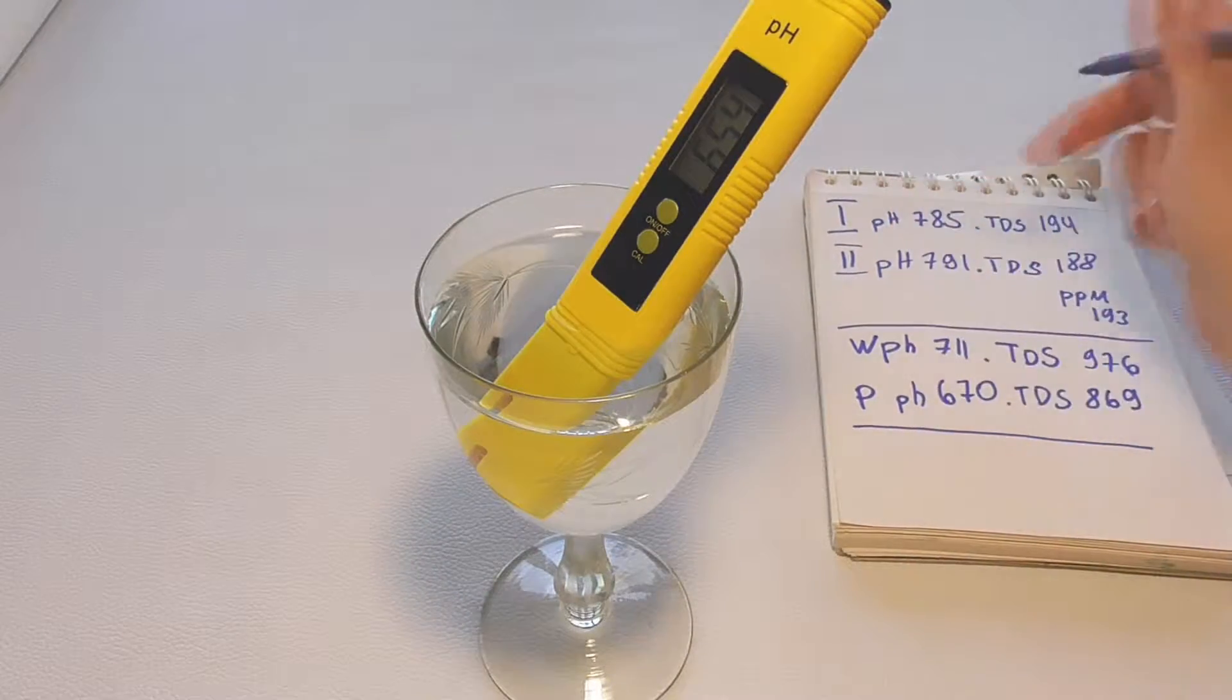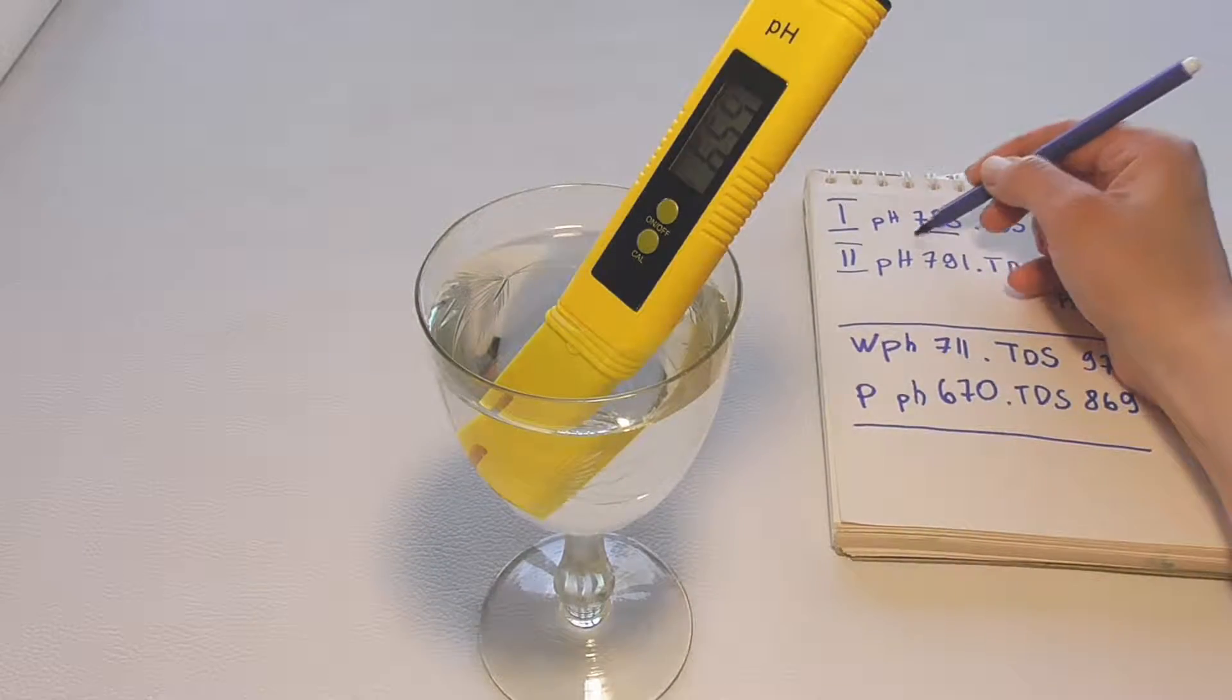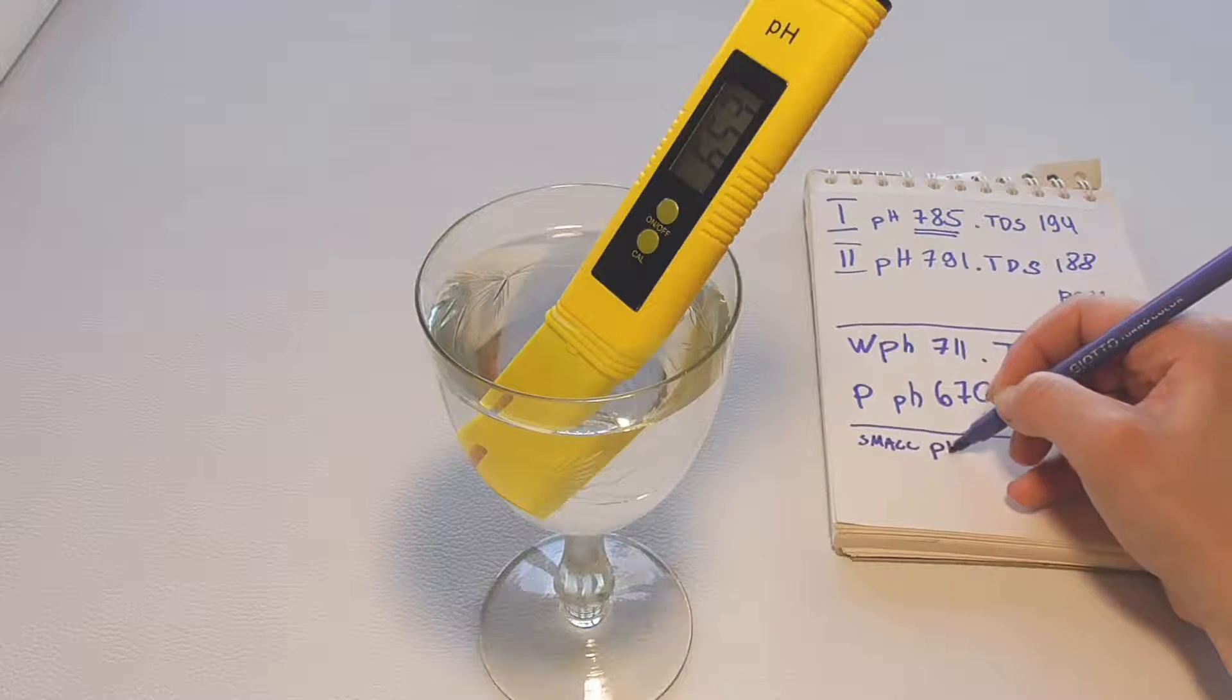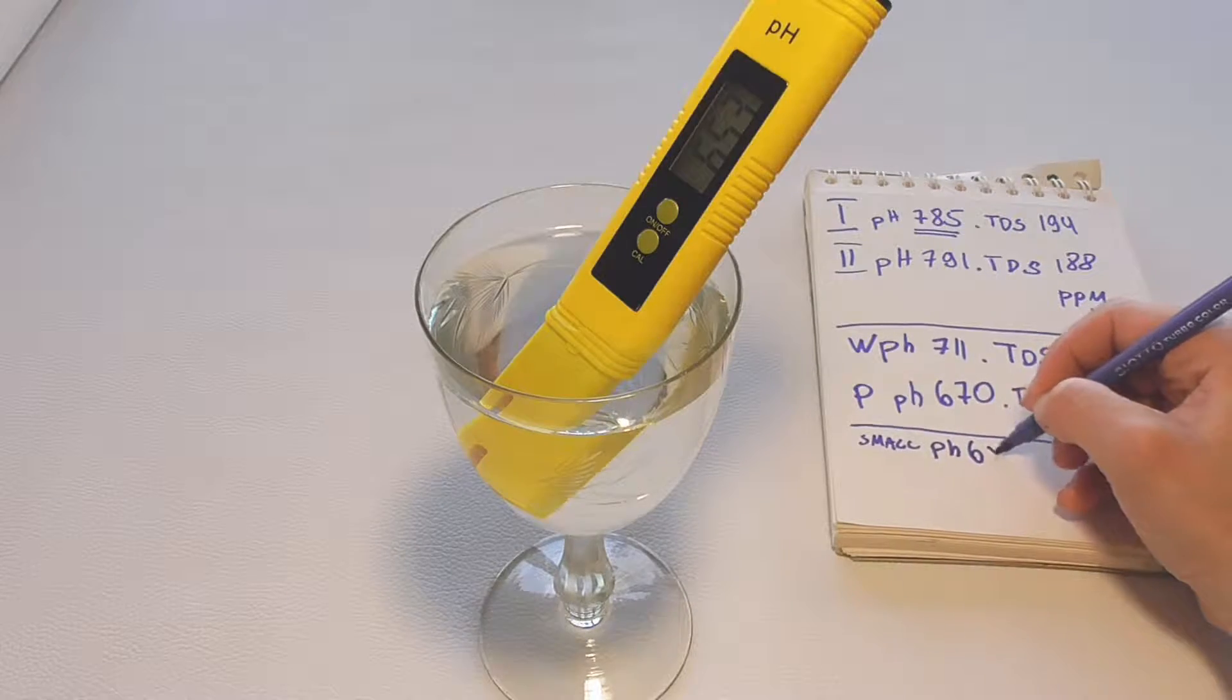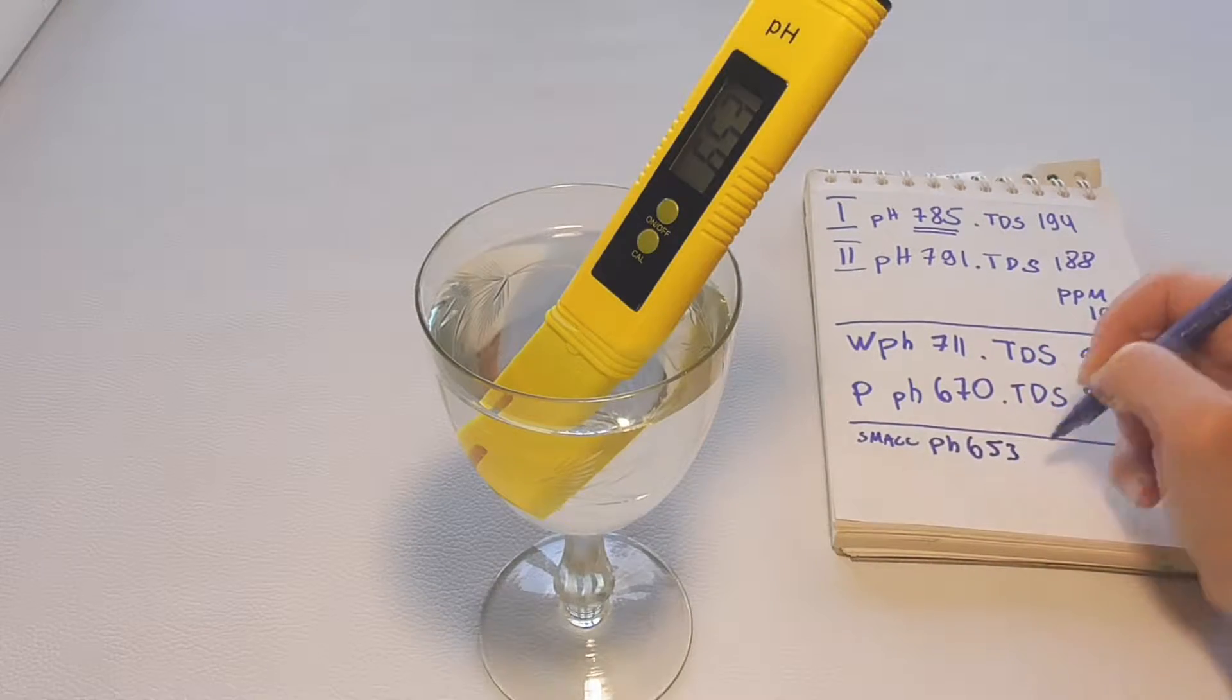Features built-in calibration with two buffer powders. Just press a button to finish the calibration. This pH meter is factory calibrated. Users can use it directly.